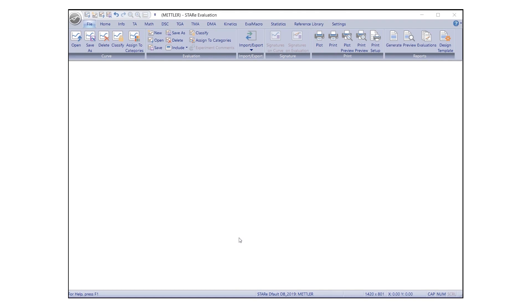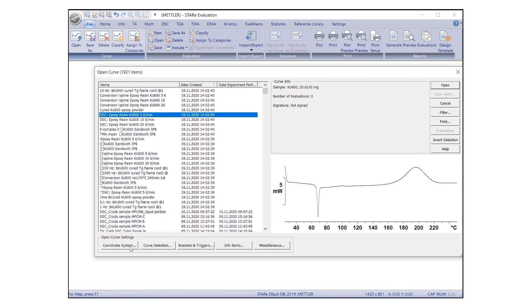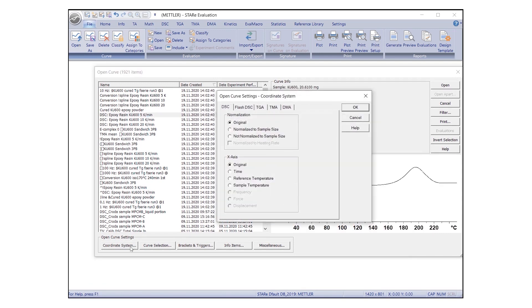To define the coordinate system, select Open Curve and under Open Curve Settings, click on Coordinate System. A dialog box will appear with various options for displaying the coordinate system.